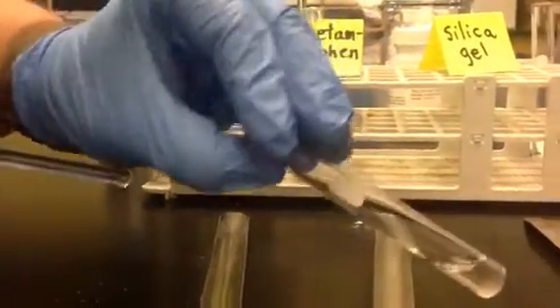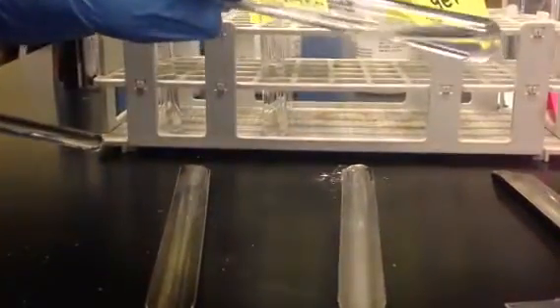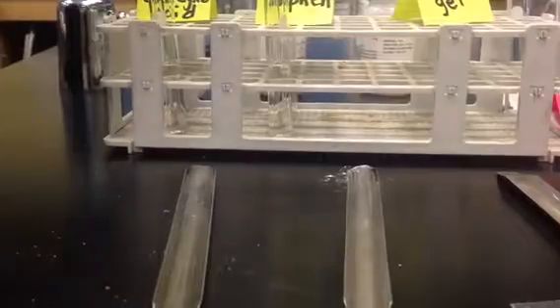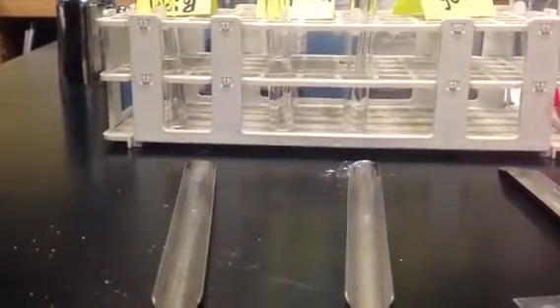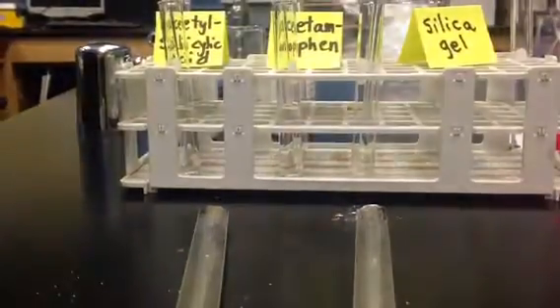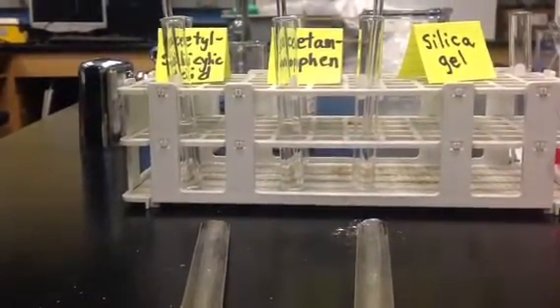And it's not dissolving the silica gel. You can see the silica gel there. I'm going to add just a little more silica gel to verify. Sometimes it's hard to see the silica gel.